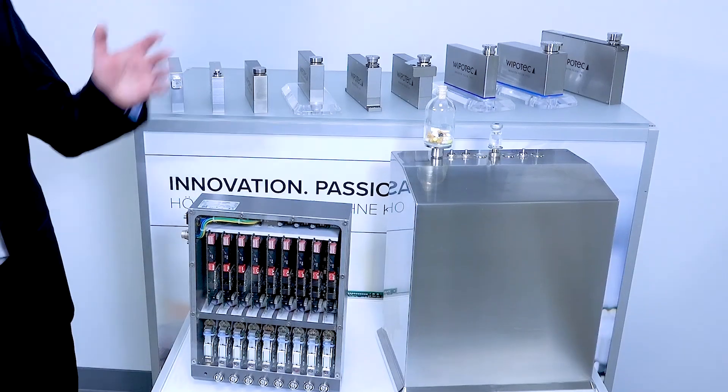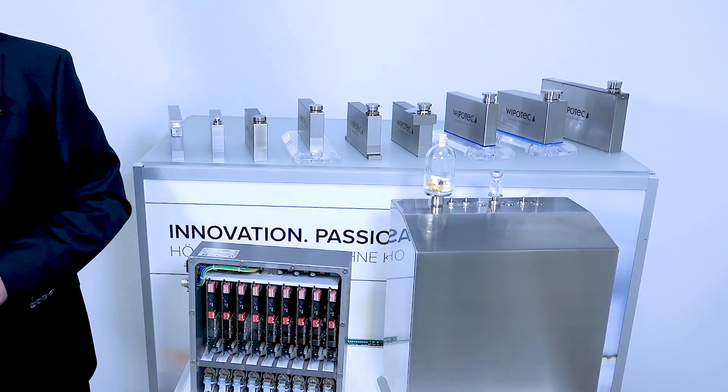Whether syringes, ampules, cartridges — you name it — we have the perfect weigh cells for all the different kinds of applications, either in stainless steel or aluminum housing. If you want to learn more about our new modular multi-lane system MMS2, please register for our pharma solid webcast.